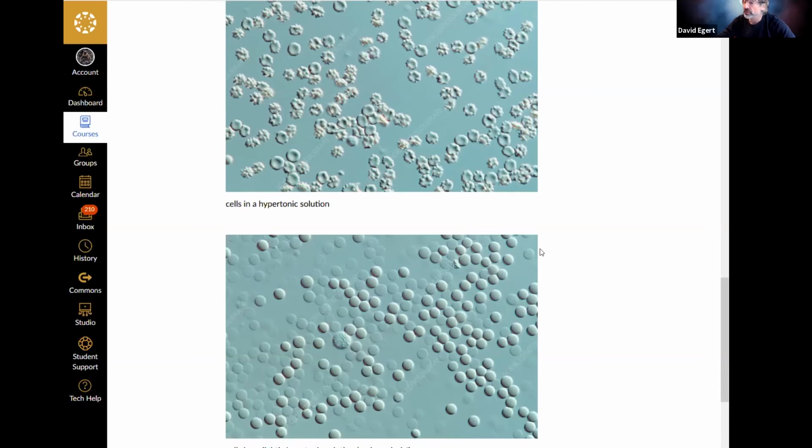So there are questions about this. In your lab notebook, you should connect what the cells look like to the tubes that we talk about in the procedure. Even though you're not going to look at them under the microscope, you're not going to draw what you see. You can print out and put a picture from one of these, what you would have expected to see in that tube. I do want you to connect the actual cells with what's happening in the tube. So any questions about that?